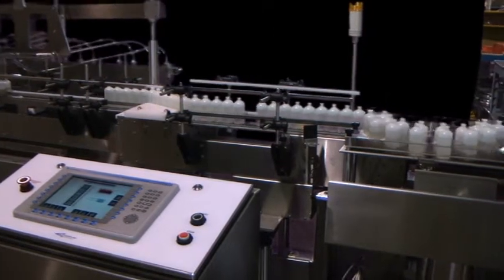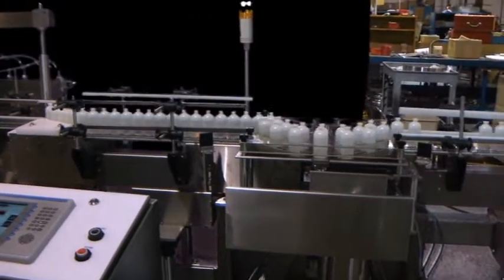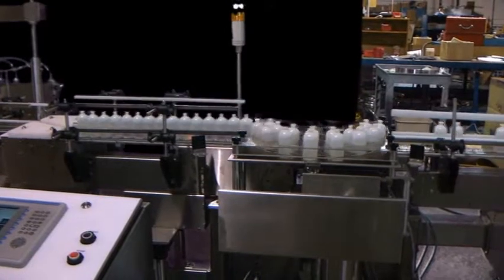After filling, each bottle passes through a 100% check weighing system that verifies filling accuracy.